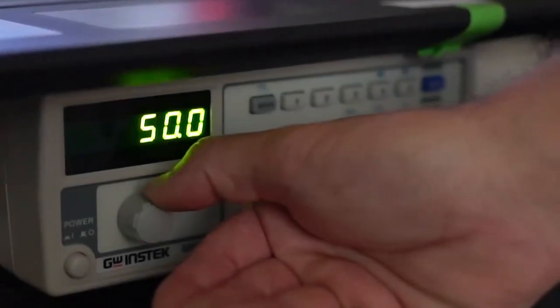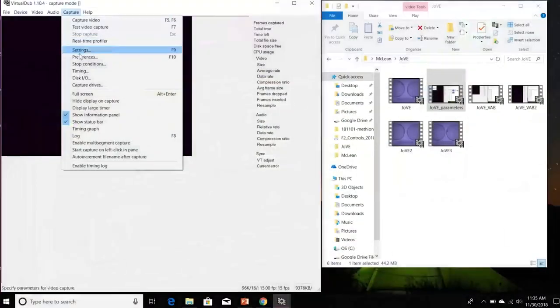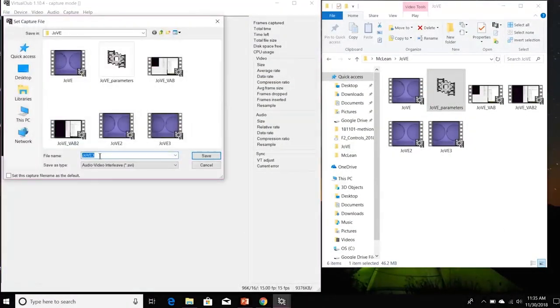Prepare vibration-emitting apparatus by tuning to 40 Hz. Set the proper recording parameters, stop conditions, and destination file.